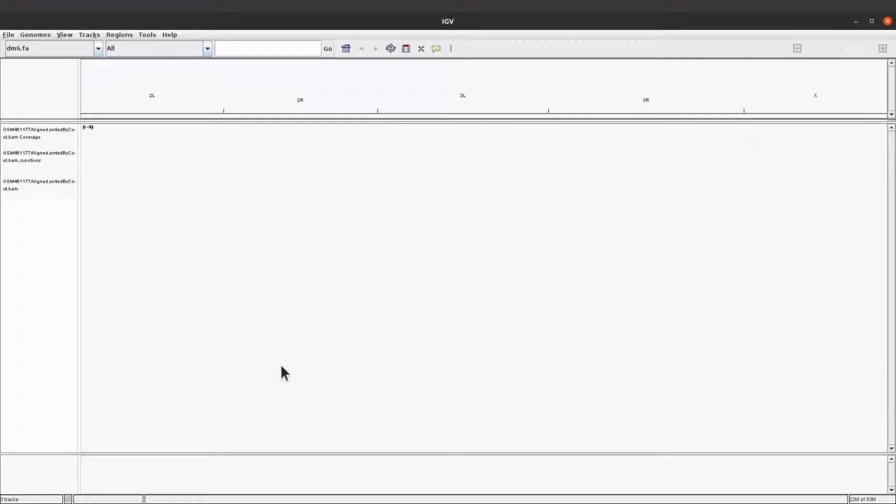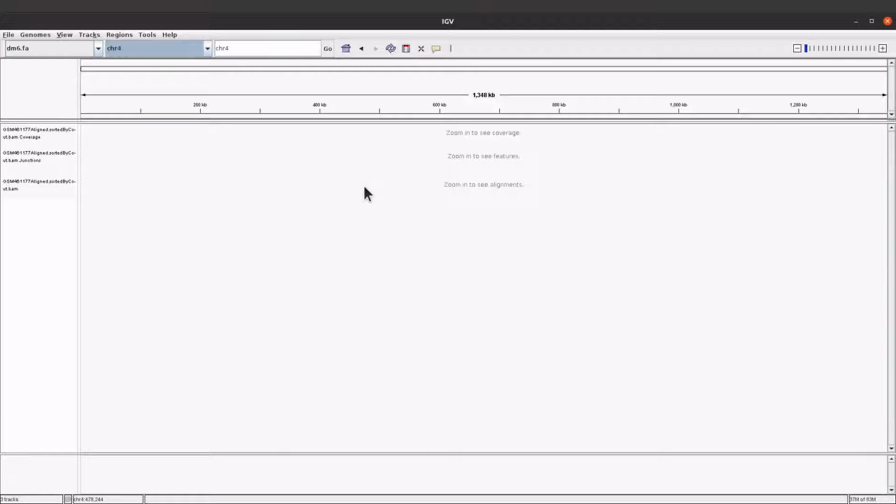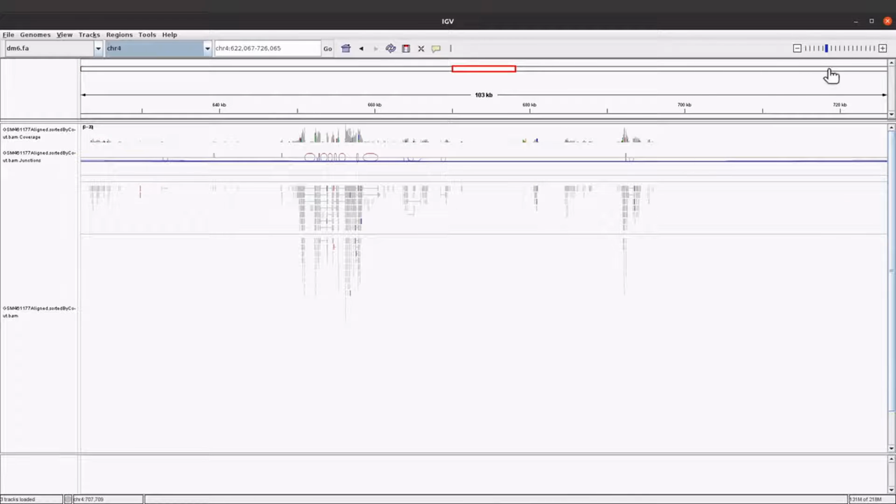So let's inspect the alignment records. So with this reference sequence, if you want to inspect a region, you have to select it. Okay, so we have the regions here. So you need to select the one that you want and then inspect the reads there. So let's use CHR4, that's chromosome 4. If you select that one, for example, you have to come to the top right side here and then zoom in. So you click on the plus and then you can zoom in. So when you zoom in, you will see the reads. Let's zoom in a bit.